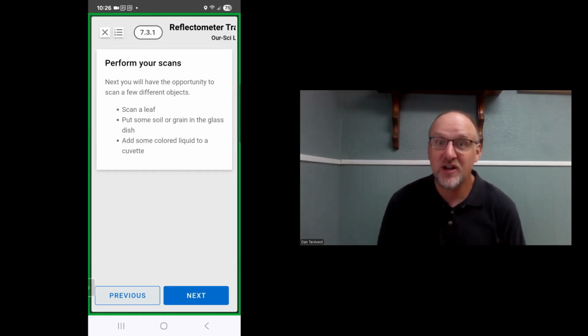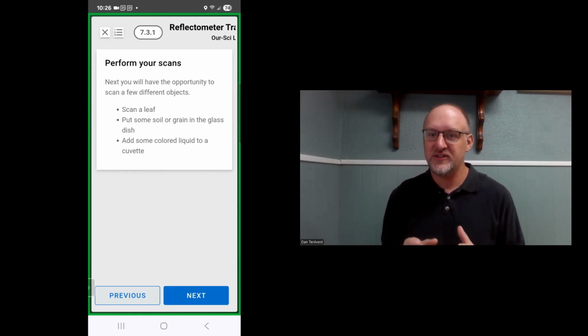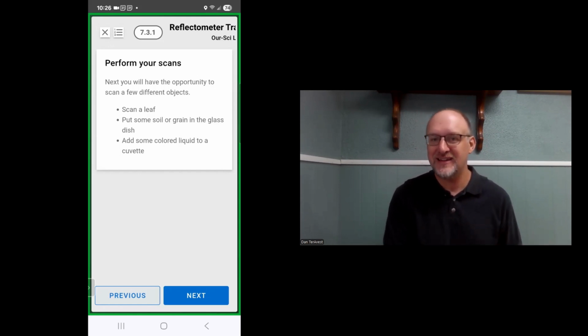In this video, I want to talk about generating quality soil scans. Now, there's two purposes why you might want to be scanning soils today. The first is you're trying to generate a calibration or training data set with which to create soil carbon prediction or classification models to be used at a later date.